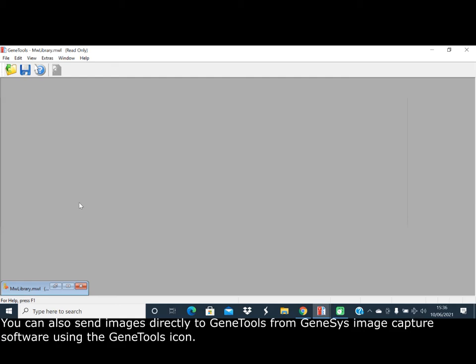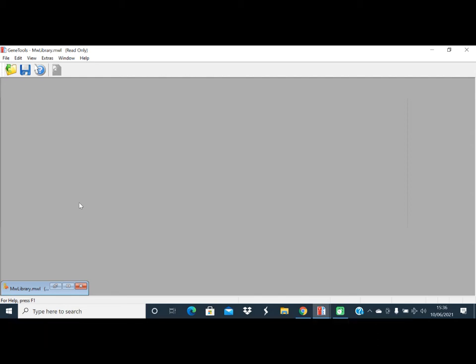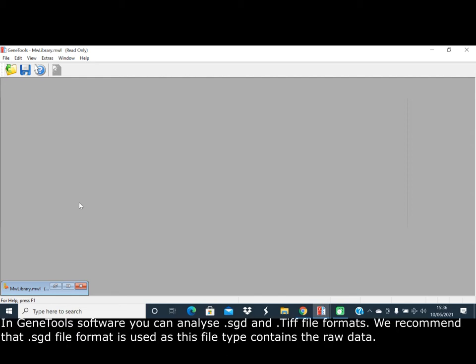You can also send images directly to GeneTools from GeneSys image capture software using the GeneTools icon. In GeneTools software you can analyze .sgd and TIFF file formats. We recommend that the .sgd file format is used as this file type contains the raw data.